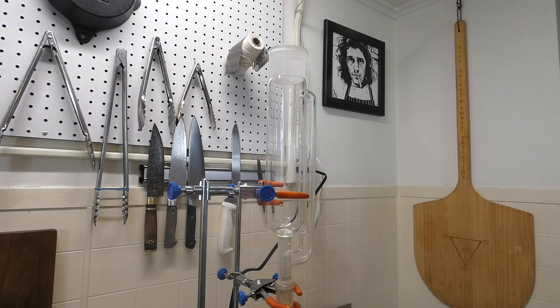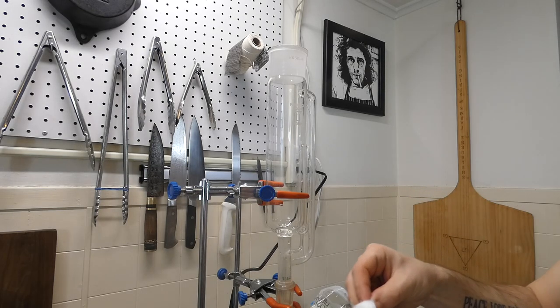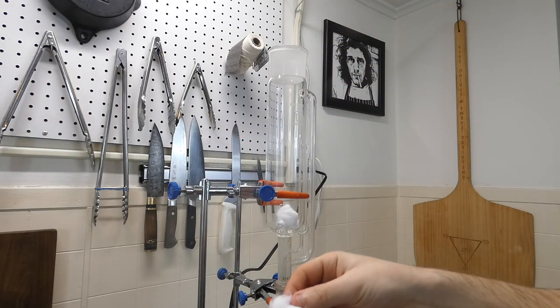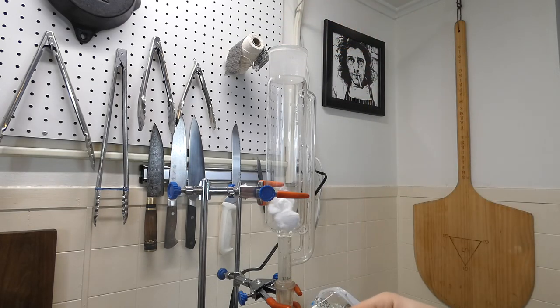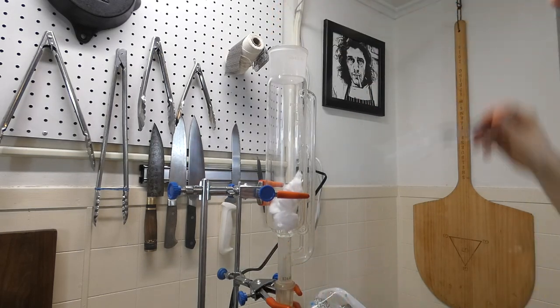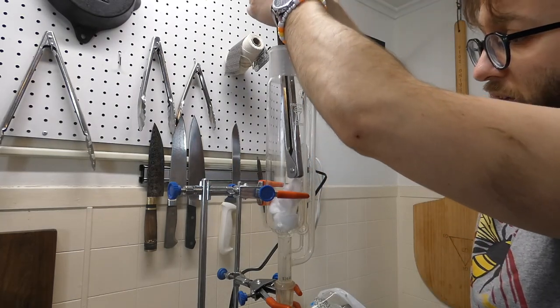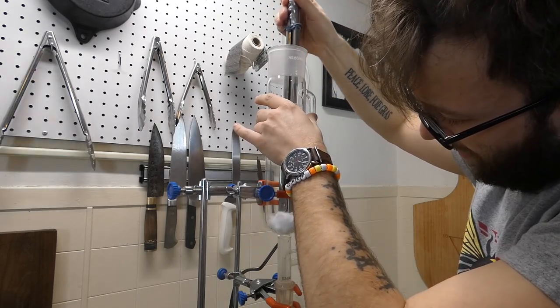All right, so now that you've got this part set up, you're gonna take some of your cotton balls, open them up a bit like so, and you're just gonna pop them in there. Now, depending on the size of the Soxhlet extractor you have, this will be a little different for each one. I'm just gonna put in three to start and just take something long enough to push it down. Take this guy, and we're just gonna push that down like so. Not too tightly though, so the liquid can still get out.